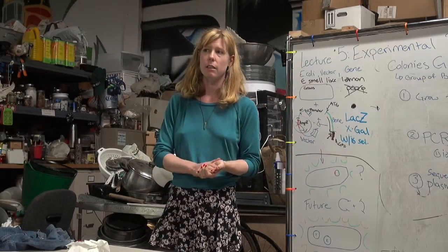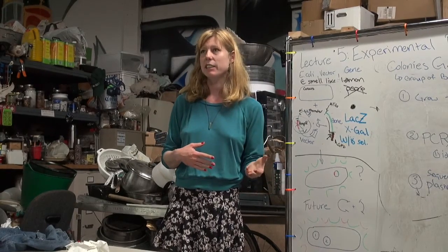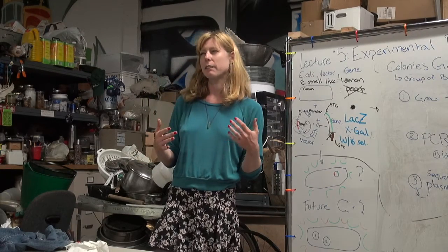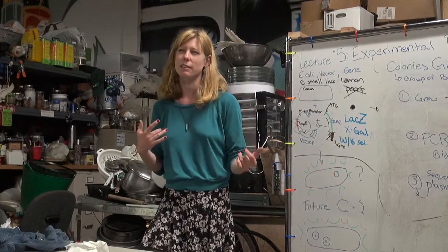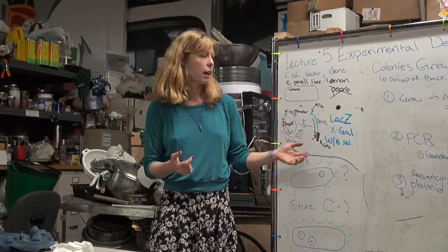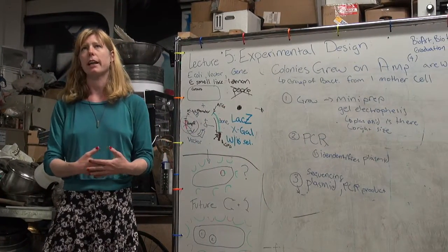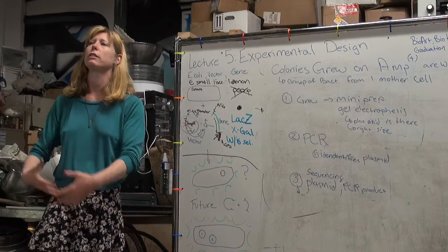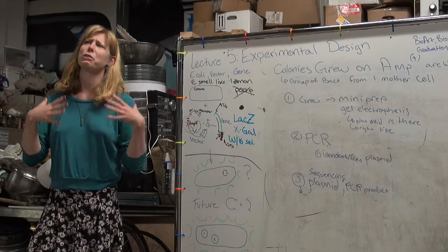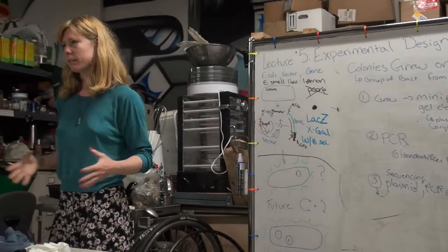It's also nice to know that just because those aren't growing, it could be that the cells without ampicillin resistance are just slower or having a harder time growing. It's really nice having a positive control, since otherwise you could get a false negative. These cells should be growing on this ampicillin plate.